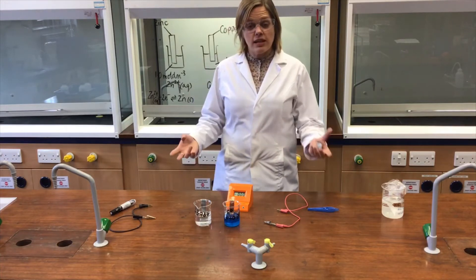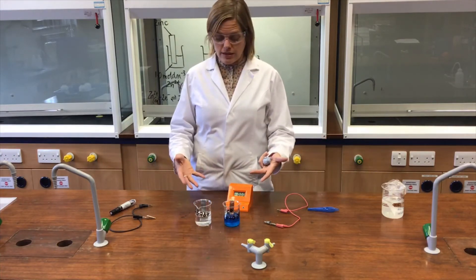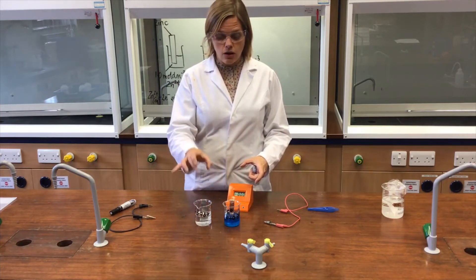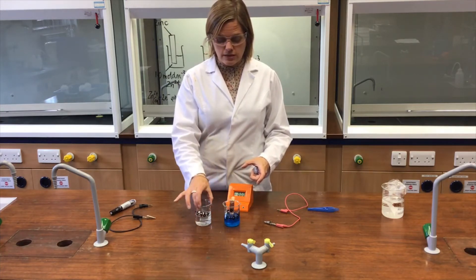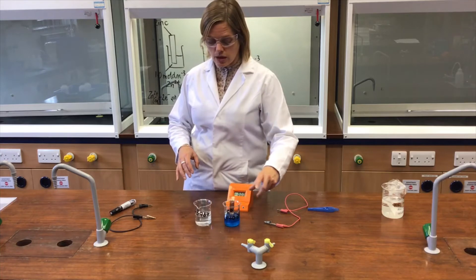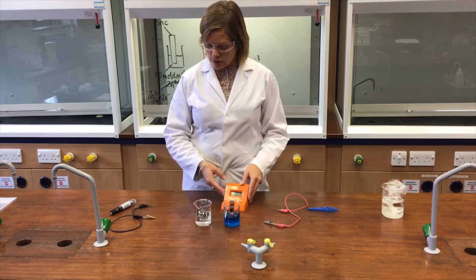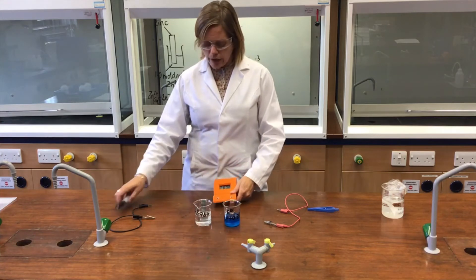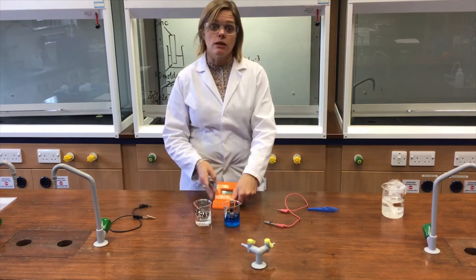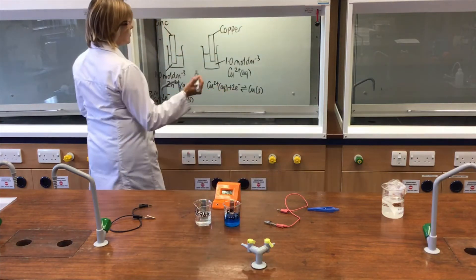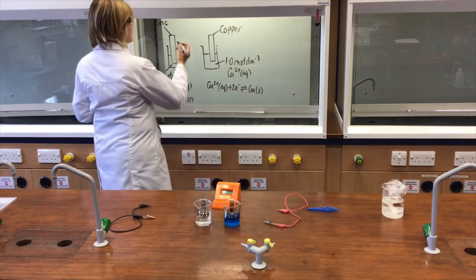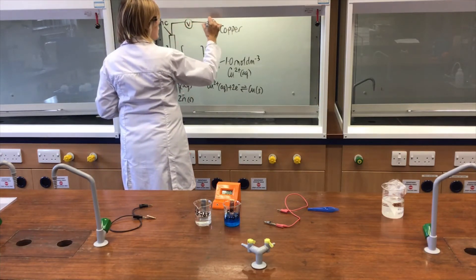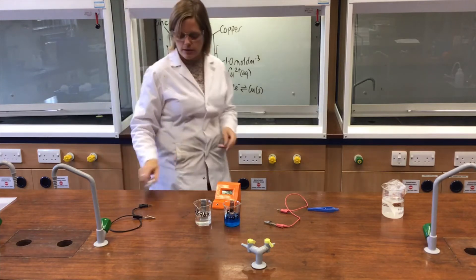To measure the EMF of this cell — that is, the difference between the E° of each half-cell — I need a high resistance voltmeter. High resistance means low current flowing, which stops current from flowing and allows the potential difference to be measured. I'll place this high resistance voltmeter between the two half-cells.